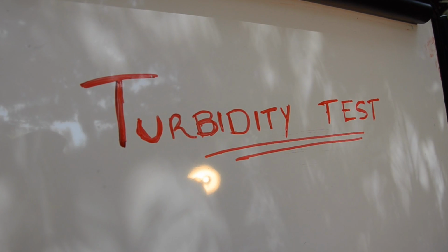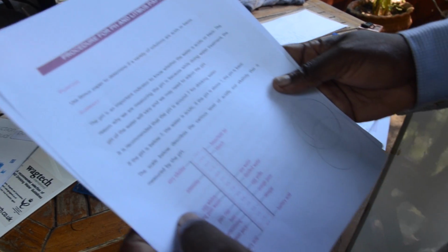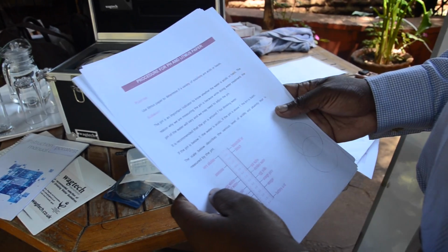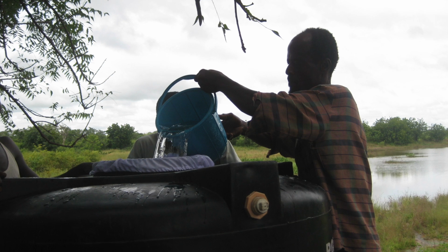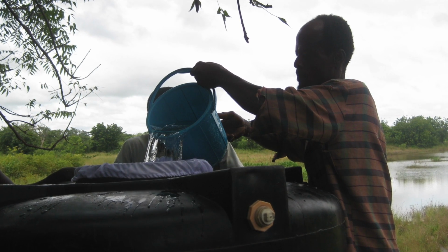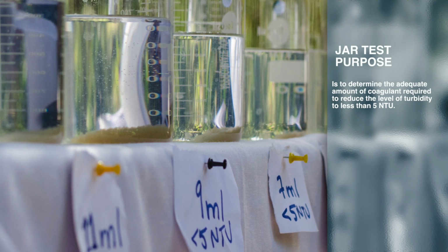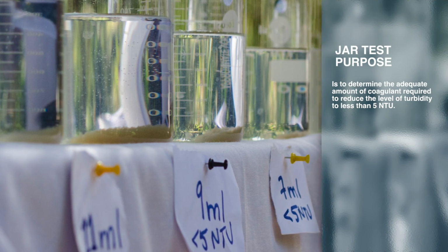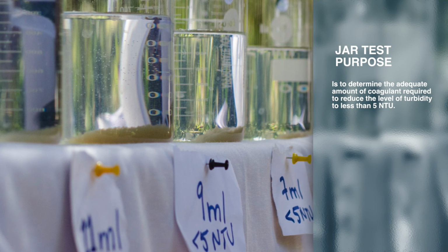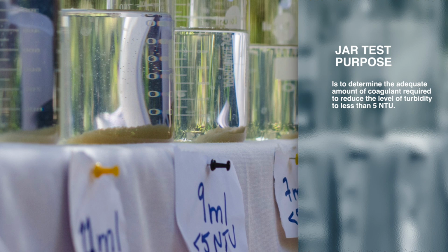After conducting the turbidity test, if the level of turbidity is still more than 5 NTU, or 20 in emergencies, you should undertake a pre-treatment procedure to reduce the turbidity and then to ensure effective chlorination. The next experiment, called a jar test, helps us to choose the adequate amount of coagulant required to settle sediments in water through the process of coagulation or flocculation.